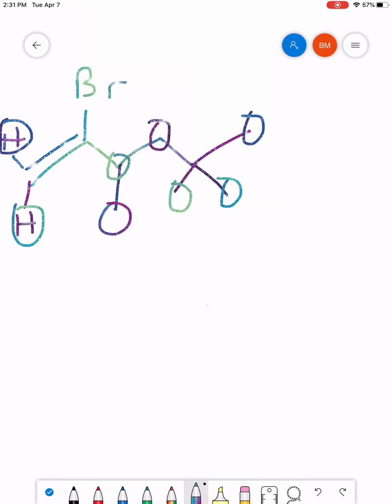Okay, so what I can see here is I think all of these methyl H's are going to see the same exact environment as each other. There's going to be definitely a bit of symmetry in this tert-butyl group, so these guys are all going to be equivalent. We'll call those A. This is a unique group over here. That's B. This is a unique group.